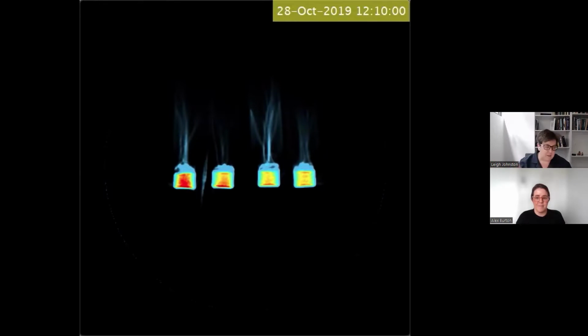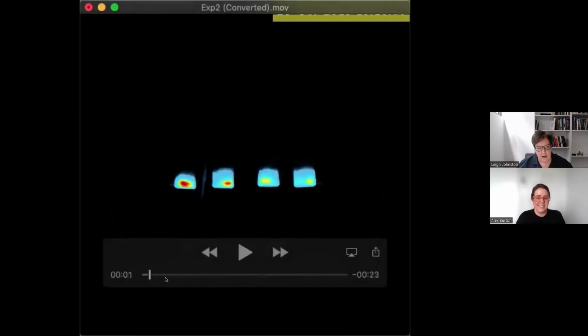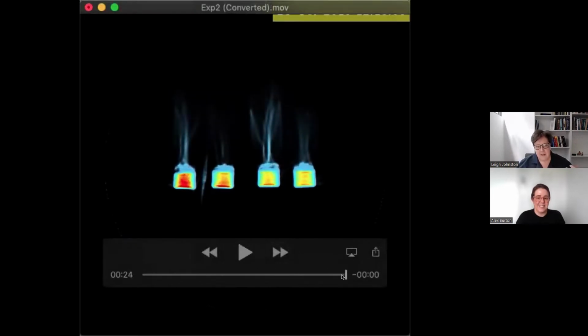I shouldn't probably have used the word butchering, but you get the idea that this kind of 3-dimensional imaging is a really, really powerful way of tracking differences without having to set up such a quite tedious study of slicing and dicing and measuring in a very different way.